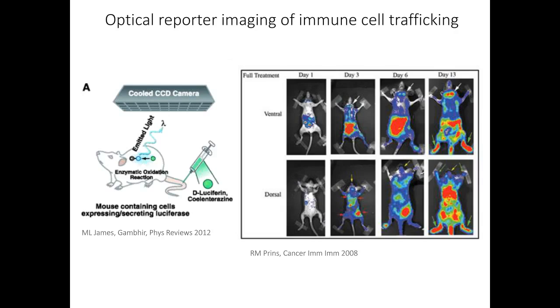But additionally, you also see that T cells are developing in other regions of the body, in other lymph organs, in particular bone marrow and spleen. And earlier we mentioned using antibodies.